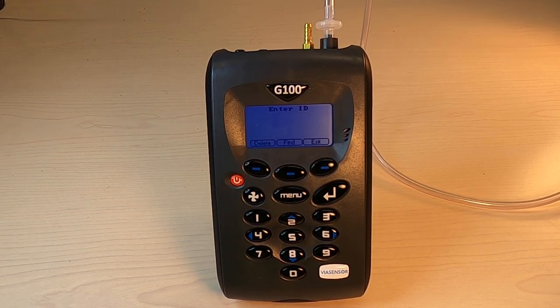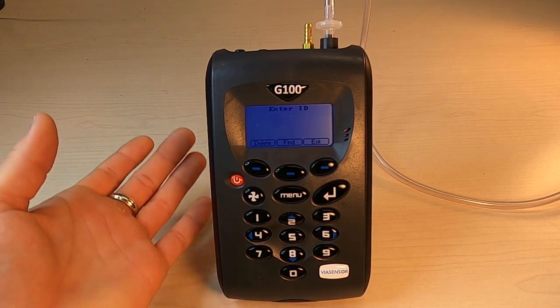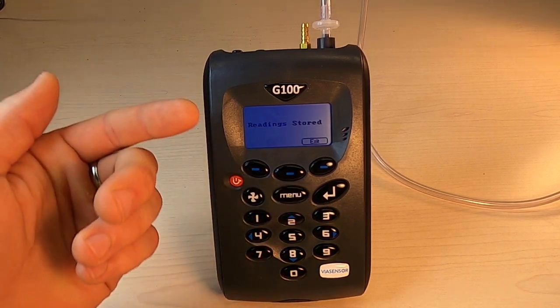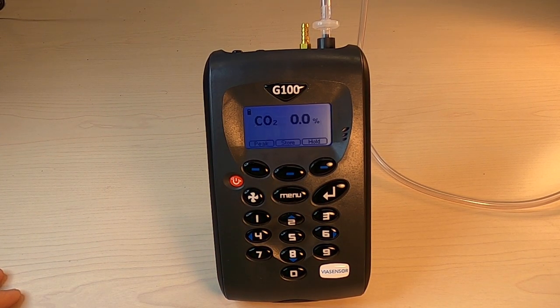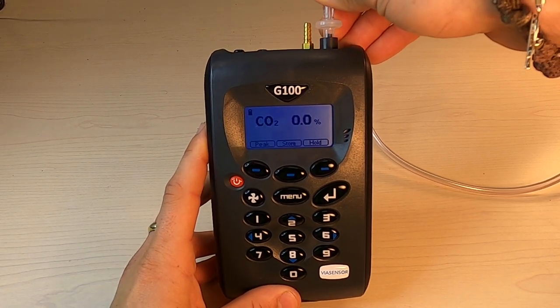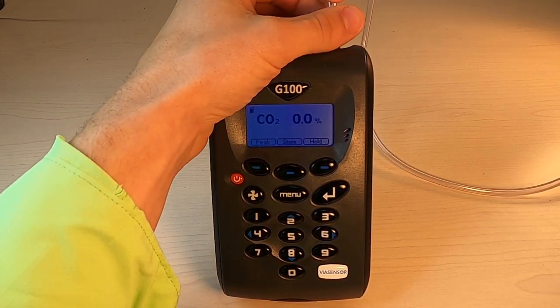You'll then be prompted to enter an ID, which would be the case if you've gone through and set an individual ID per corresponding sample point — say, if you have multiple incubators or similar. Once you've entered your ID, you just hit Enter, and you get the confirmation message that your reading has been stored. You're then ready to disconnect your sample tubing — just be gentle.